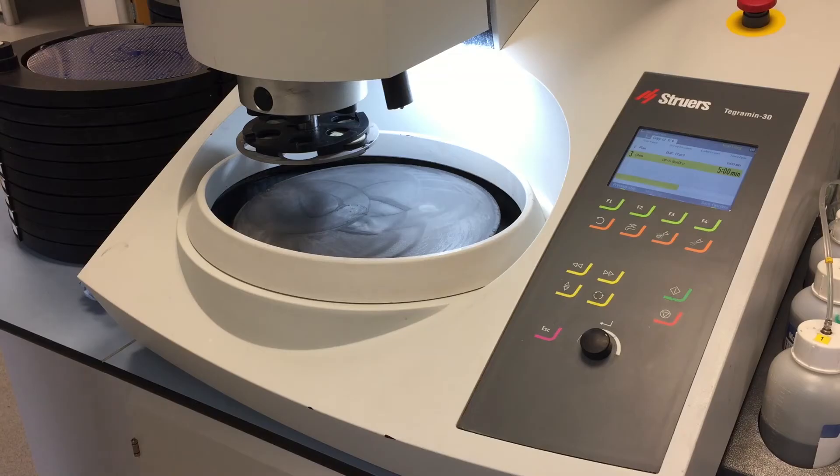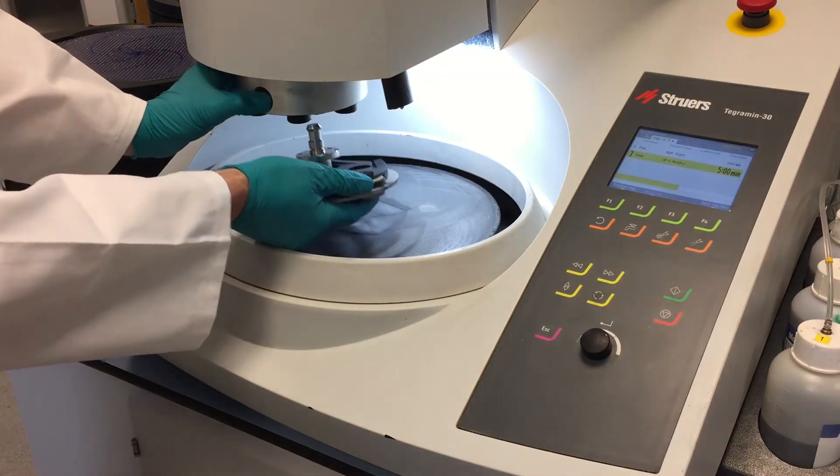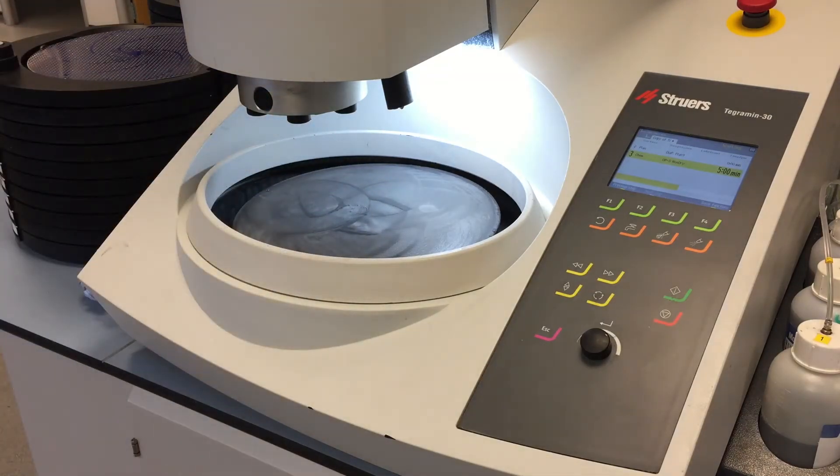Off we go for cleaning again. Matt's taking it away for cleaning — you probably noticed the button he used on the front of the machine to release the sample mover plate. The great thing about that is it always comes back to the front so you're not searching around for it. Just one of those nice little things that Struers does for you.